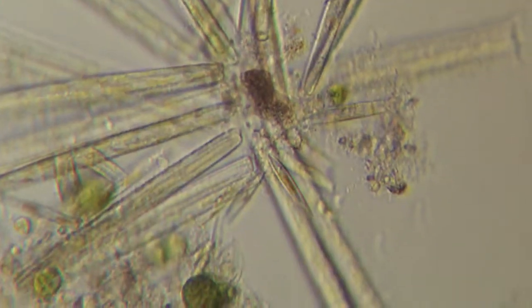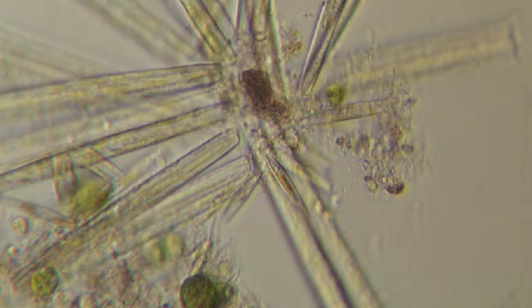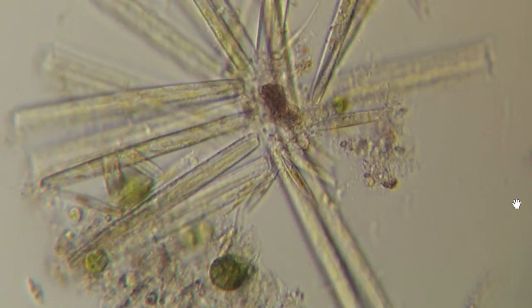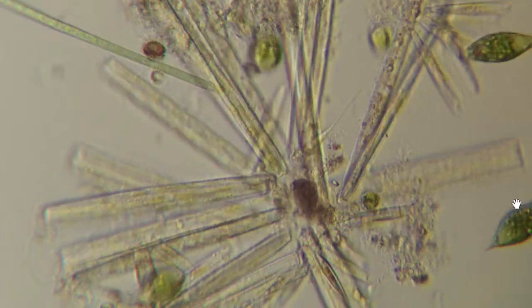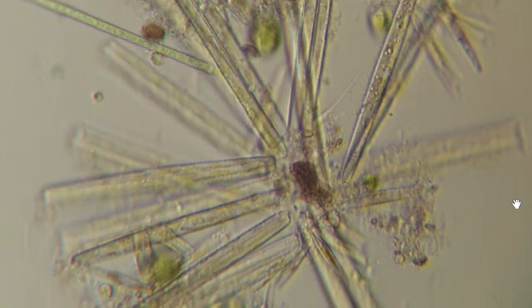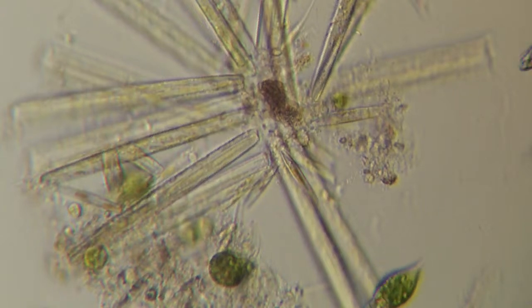Euglena, more diatoms. Ooh, there's a whole cluster of diatoms. Look at that. It's kind of fun how they'll do that. They'll kind of bunch around some debris and make this spoke design. Nice little spoke design there. And you can see those little ridges going down the shells like I was talking about. The raphe. Euglena are everywhere still.